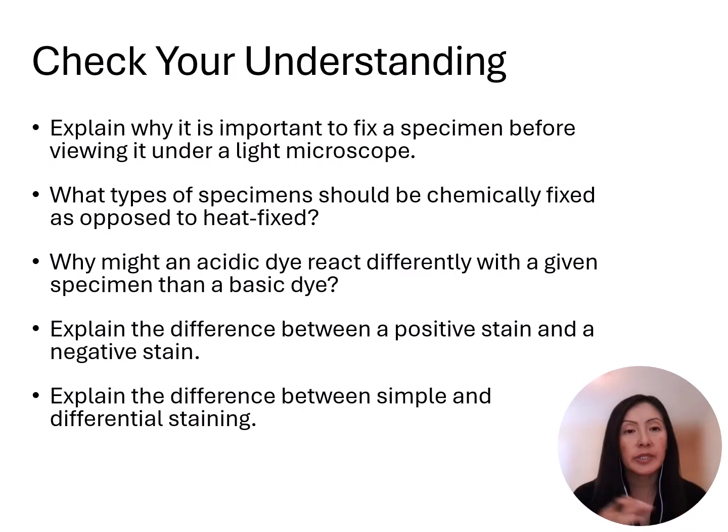All right, checkpoint time. First one, why is it important to fix a specimen? We need to fix the specimen to attach it to the slide. It also kills the microorganisms and preserves the structures within the cell. It also prevents movement of the organism. It prevents decomposition, so you can have a more accurate observation.